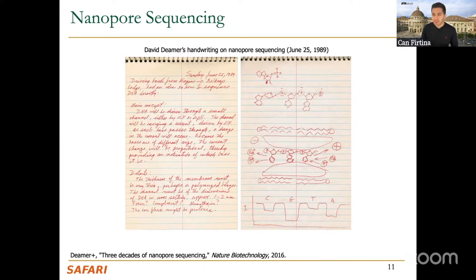Would it be creating a descriptive and disruptive change in the environment? And it is descriptive enough for us to say, okay, this is the A that is now moving through that pore, because it is causing a disruptive change and also a descriptive change in the field. So this was the next question. These are physically plausible questions, right? And theoretically, perhaps even correct.